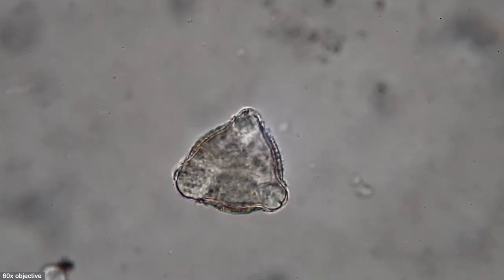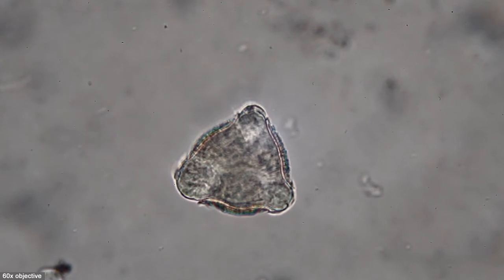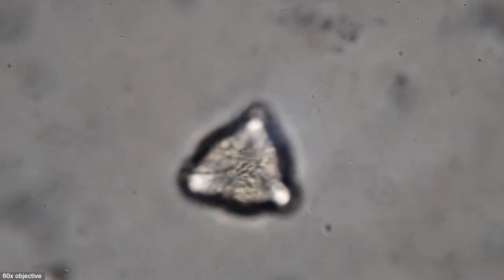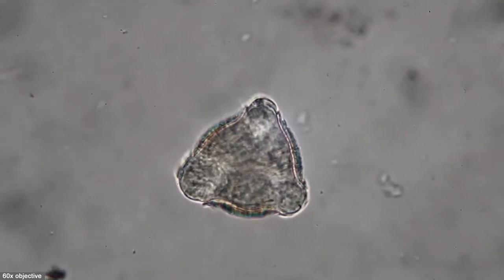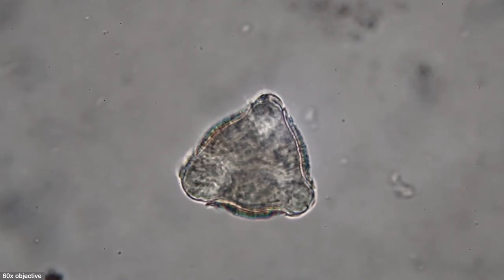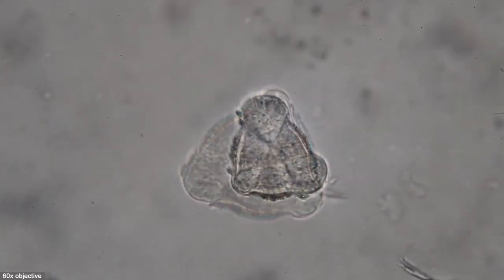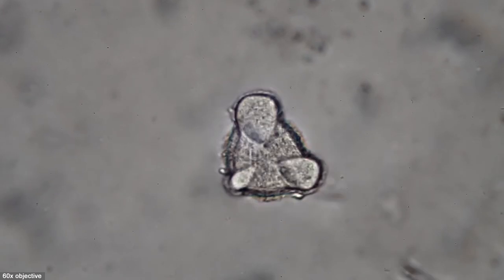And some of them were also triangular in shape. So you can actually see that the pollen did come from different plant species. Now, I'm not really good at identifying the plants that the pollen came from. That's something that we better leave up to the experts here.